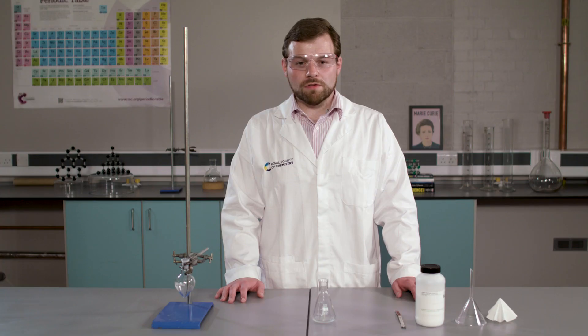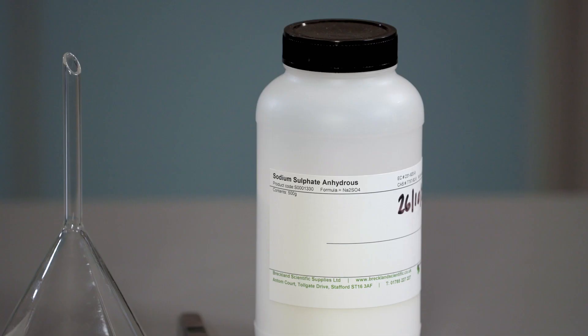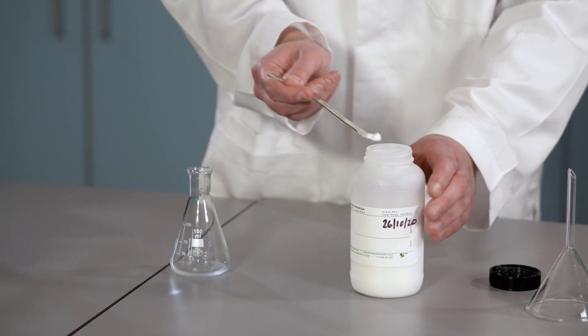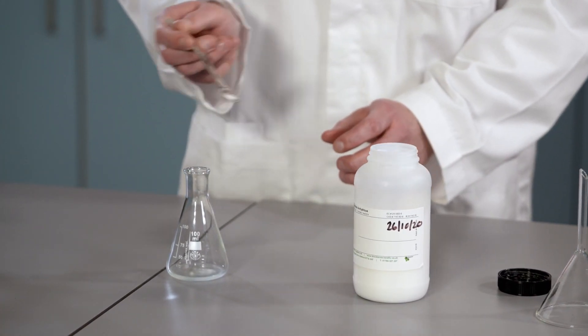We now need to remove the trace amounts of water from our organic liquid. To do this, I'm going to add anhydrous sodium sulphate. The anhydrous sodium sulphate is a drying agent and will form a complex with any water that remains in the liquid. I'm going to add it by the half spatula full and swirl each time.